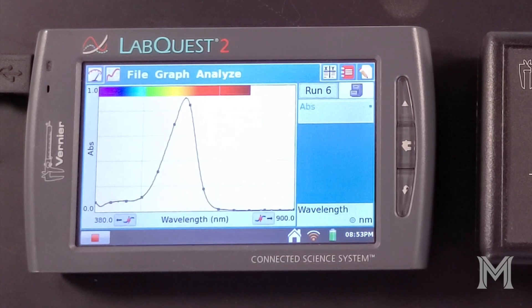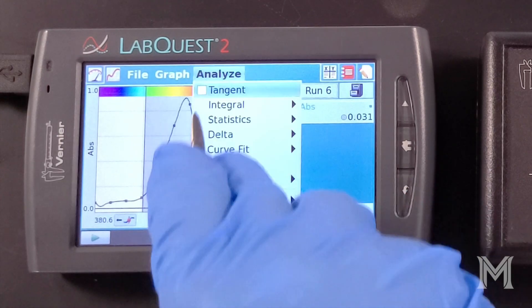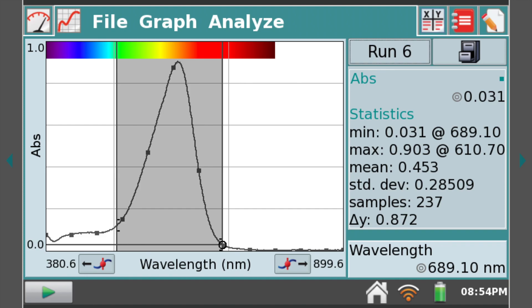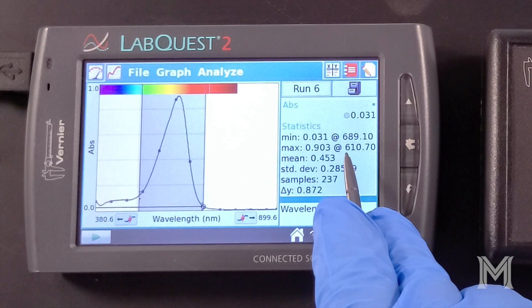Our last dye sample also appears to absorb in the yellow-orange region of the spectrum. It has a maximum absorbance of 0.903 at a wavelength of 610.7 nanometers.